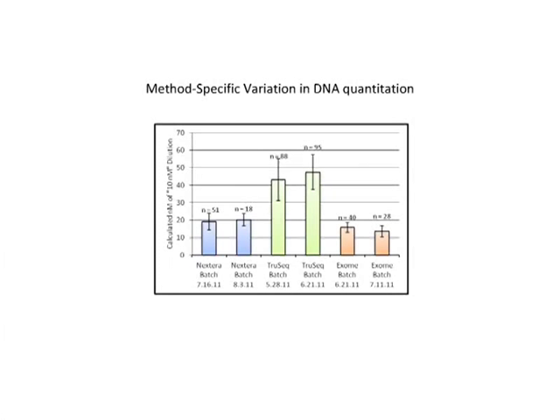capture. As you can see here, if we were to only use concentration and size, being fluorometric concentration as well as the size of the library, we would see as much as a twofold difference in actual molar amount of the library. When you incorporate real-time PCR into a more comprehensive quantitation, you can then correct for these sorts of differences between these three library types.